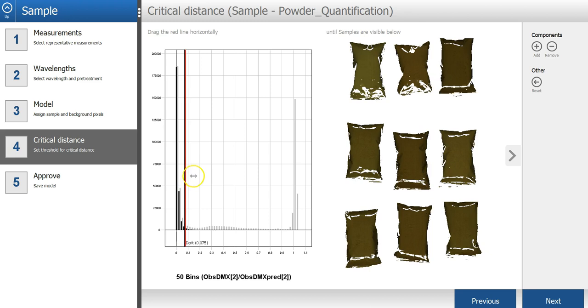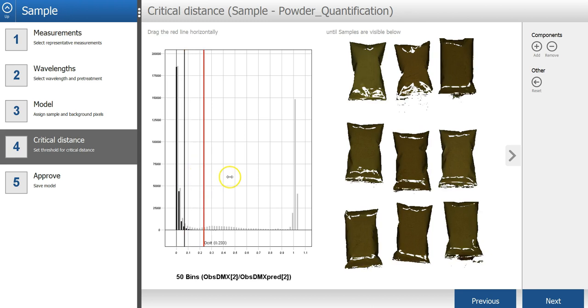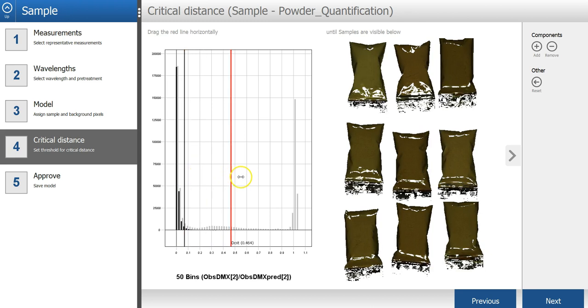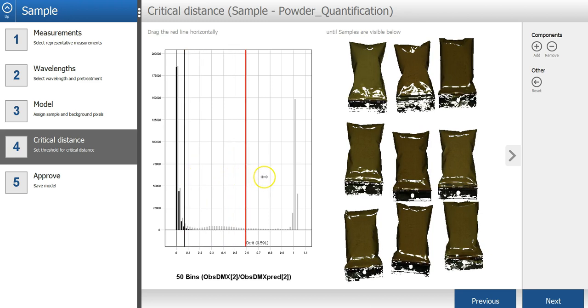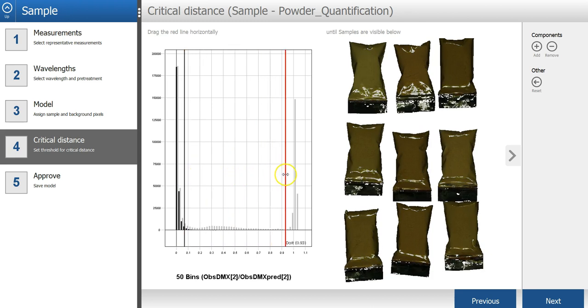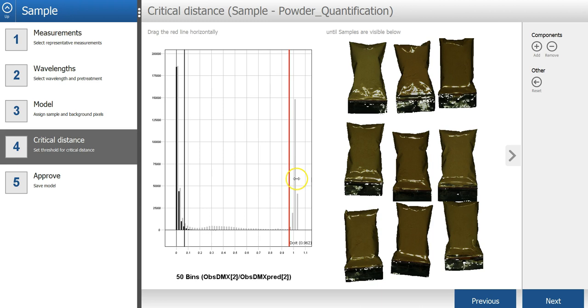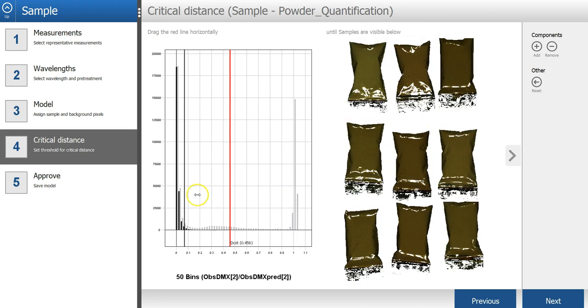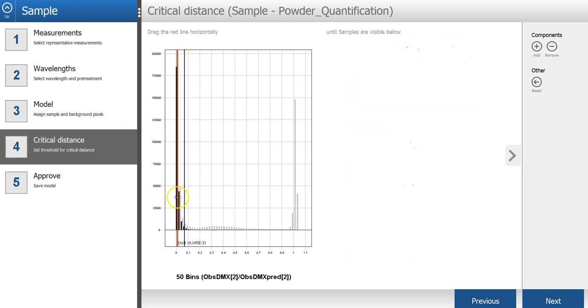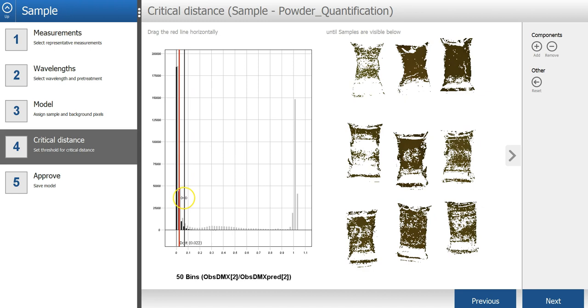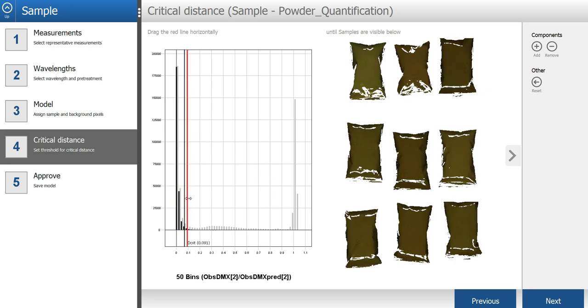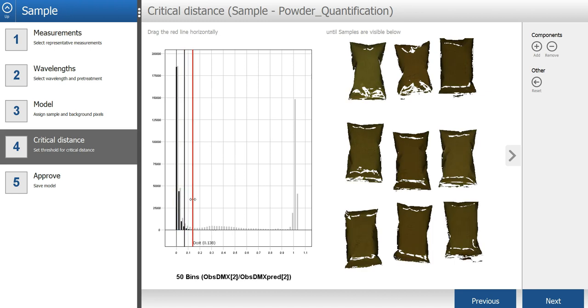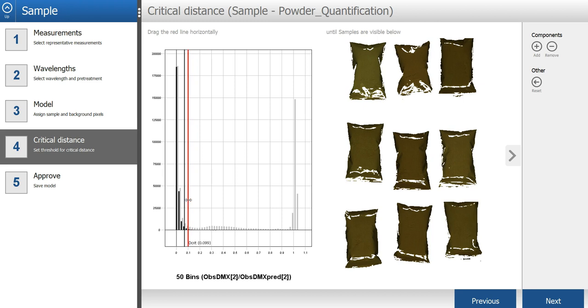The aim here is to find a level where all powder pixels are included, but pixels from the background are not included.